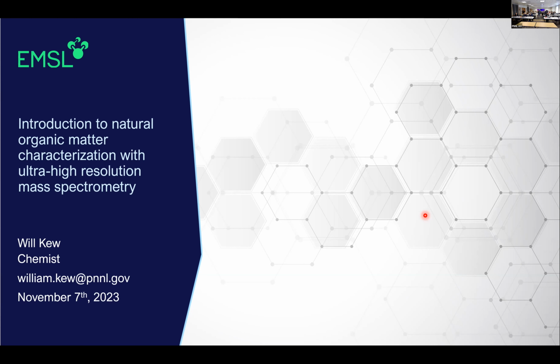So as Odetta said, I'm here to talk about a brief introduction to characterizing organic matter with high-res mass spectrometry. I'm a staff scientist here at EMSL, been here for about 5 years, and a lot of interest in method development for this sort of characterization. And then this afternoon, there's a tutorial in which I'll expand a lot more on some of the information here.